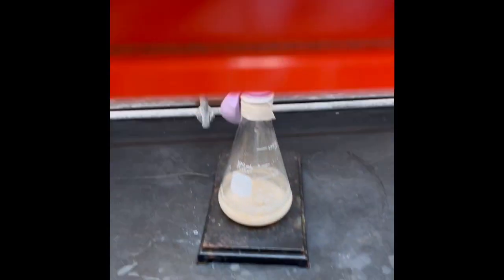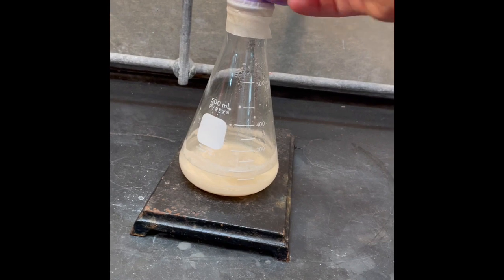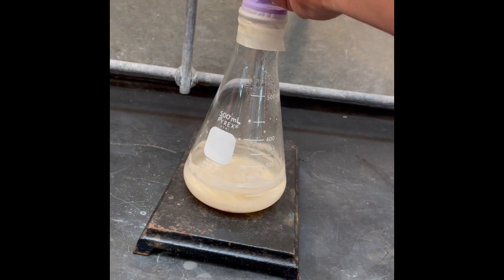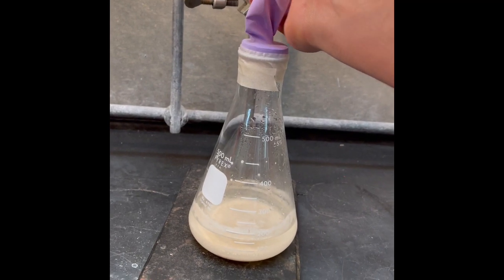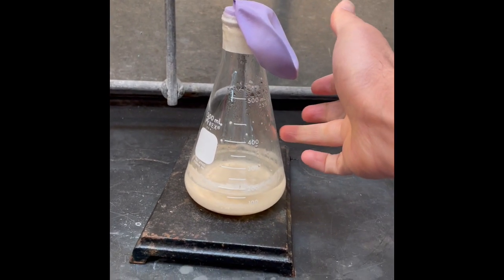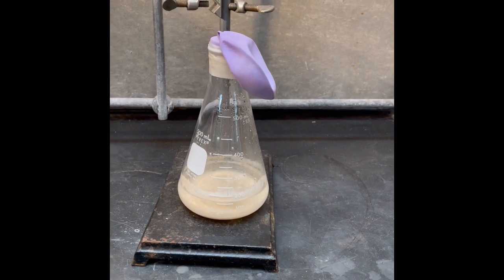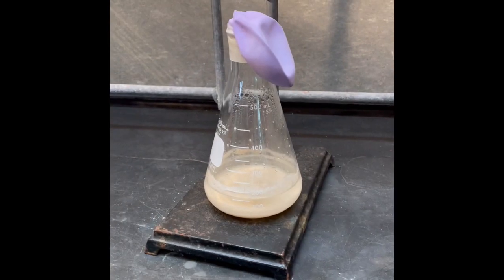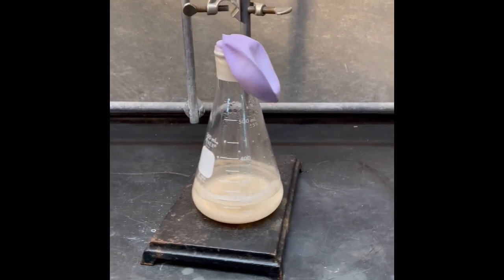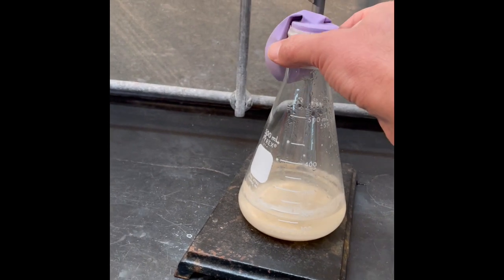Still hot, but this guy's not inflated much. It is a little bit. You can see, when I squeeze it, it still makes a bubble. So hopefully they just didn't really need to expand more than that. So it doesn't necessarily mean that we didn't form ethanol. Judging by the size of this, I don't really see.